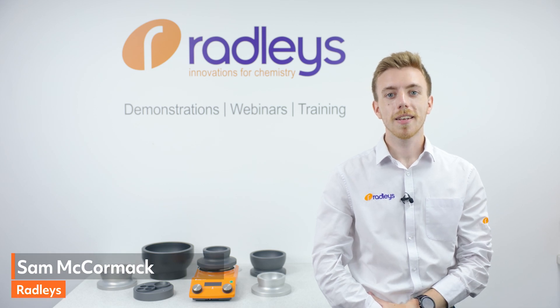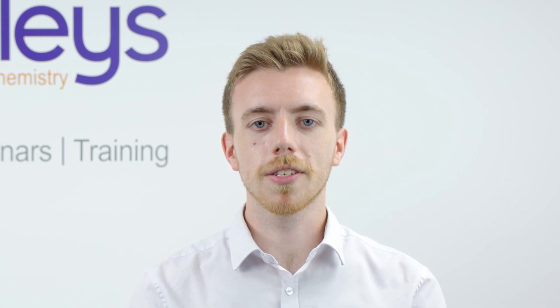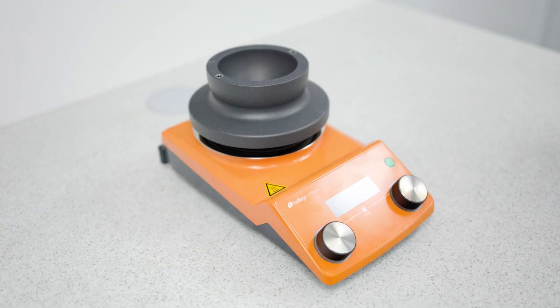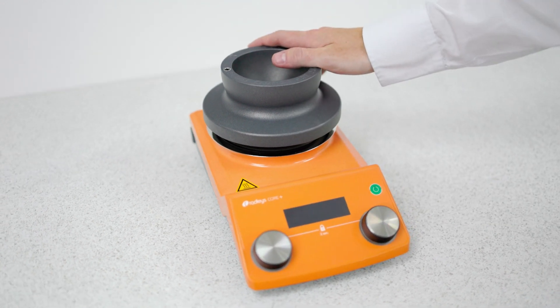Hi, I'm Sam from Radleys. I'd like to show you the Radleys Heaton block. Heaton is simply the safest, cleanest, fastest and most efficient way of heating and stirring round bottom flasks from 10ml up to 5L. The blocks are designed to replace messy oil baths or heating mantles and they fit just directly on top of a standard hot plate.